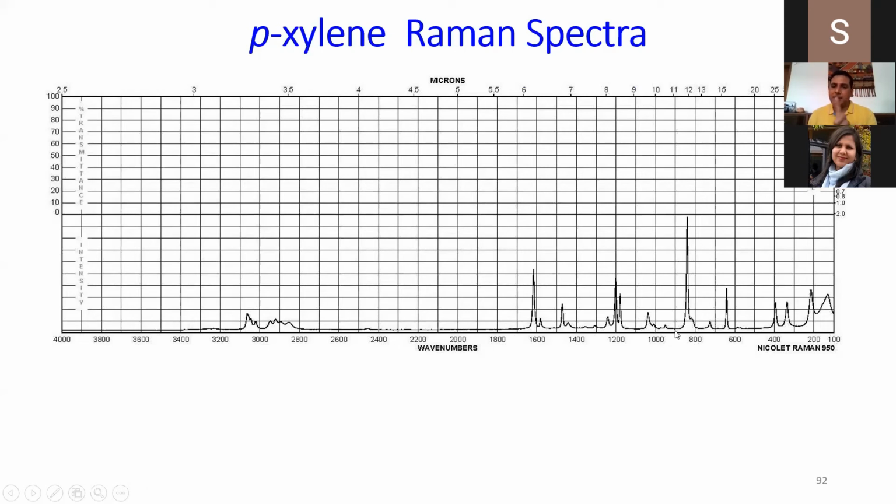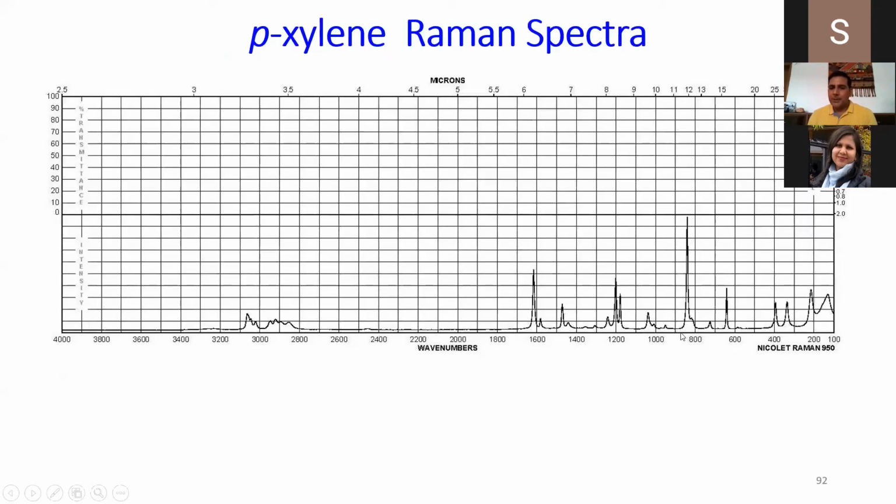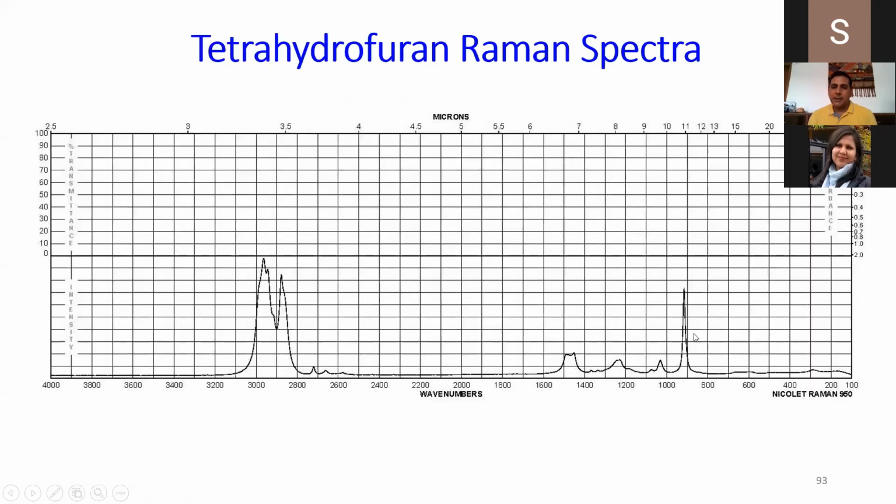So it means paraxylene and tetrahydrofuran can be characterized even if you have mixed both. Now let's see polystyrene. Does it have a peak at 900? Polystyrene also doesn't have a peak at 900. So this combined system can be studied without much difficulty, without the need of peak separation software. It has a peak at 1000, a peak at 826, and a peak at 900.